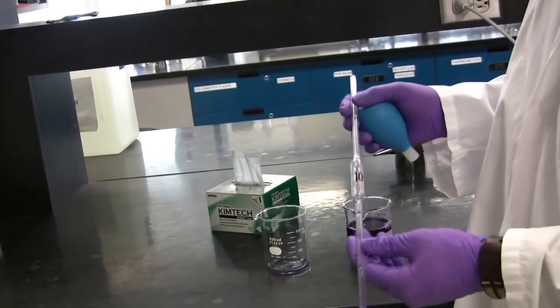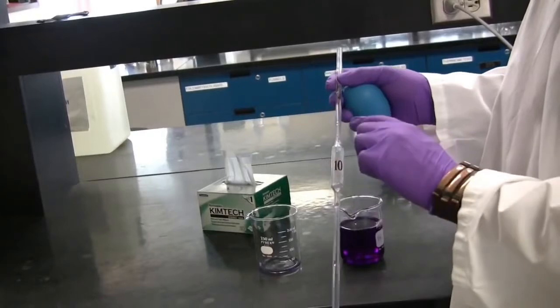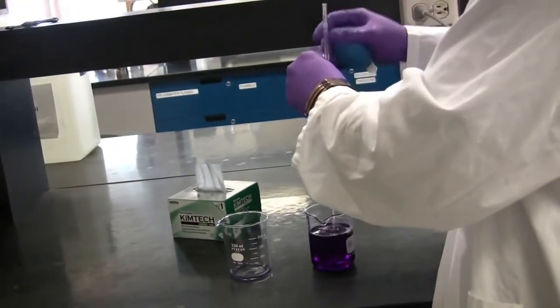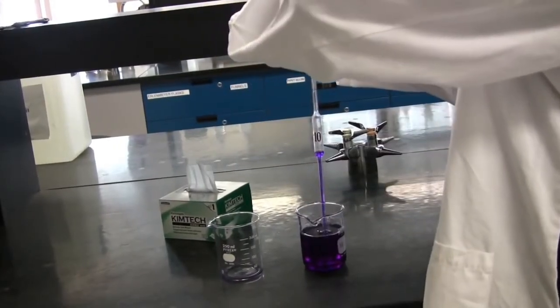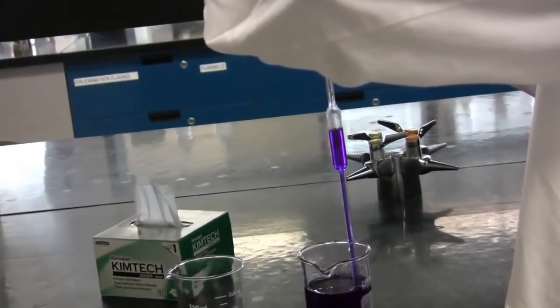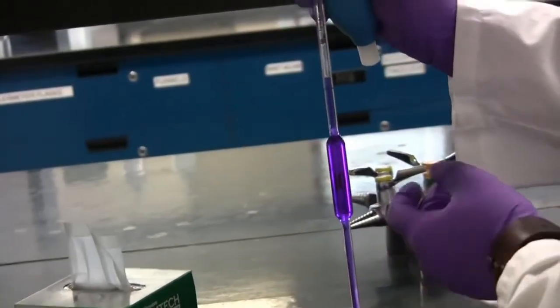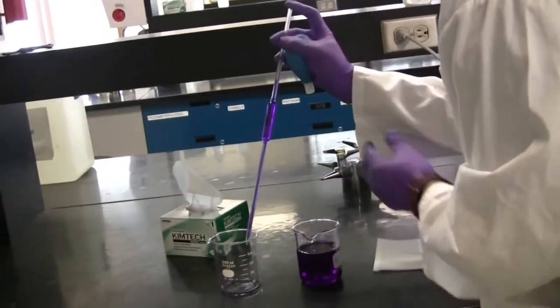The volumetric pipette is similar to the graduated pipette, but it requires all the solution inside of it at this mark. There is no excess. Start by withdrawing your solution into the volumetric pipette. Be sure to stop just above the line, as you may contaminate the inside of the pipette bulb. Stop right at this mark and wipe off the excess on the tip with a Kim wipe.